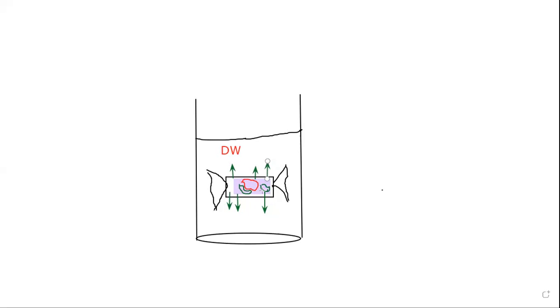Why will this ligand come out? Because the ligand is a small molecular weight molecule. It is a very small molecule which can come out of the dialysis tube. Whereas the protein, which we have separated, is not a very small molecule. It is a macromolecule, and therefore it will not come out of the dialysis bag. I hope everybody has understood this.